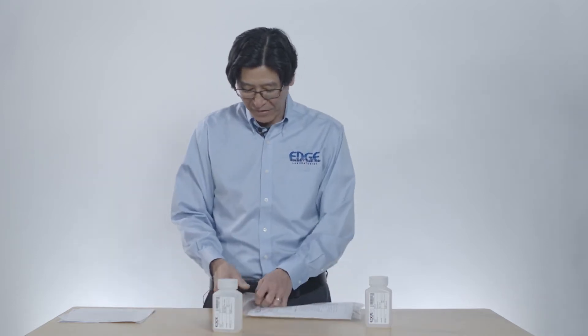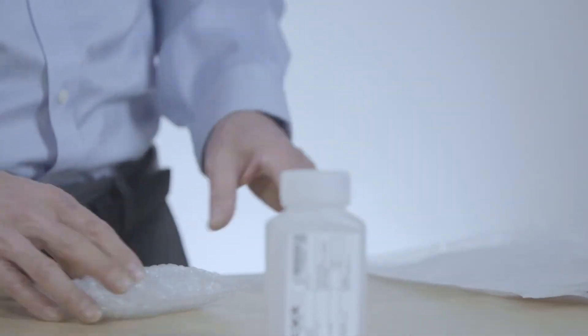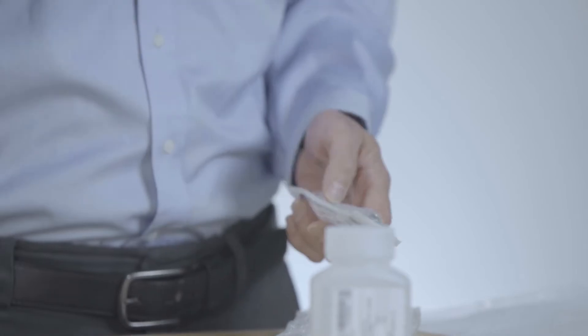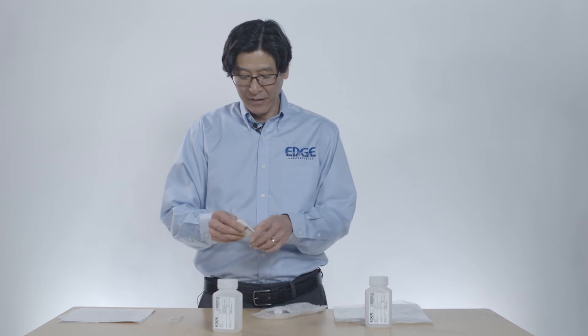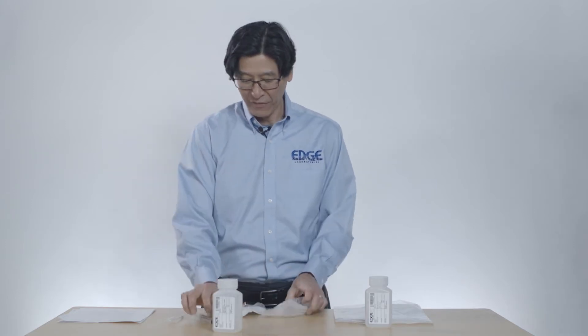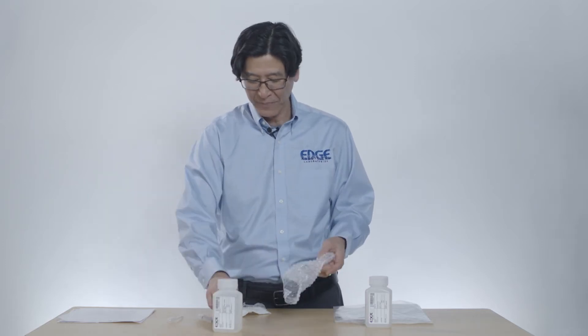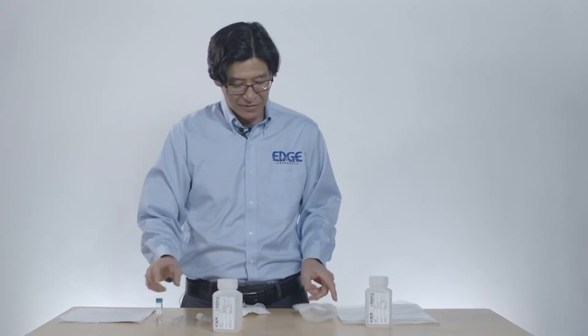Inside here we have a pipette — this is to add our preservative at the end. We have a little sampling syringe that's for doing our filtering. We have two filters, and then we have our preservative. We'll keep all this stuff together.